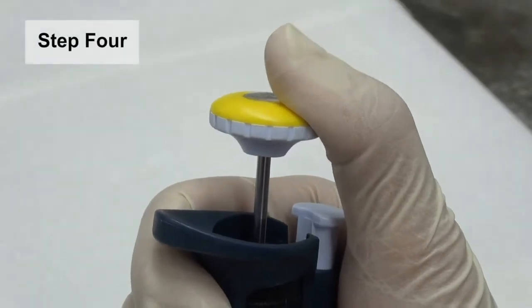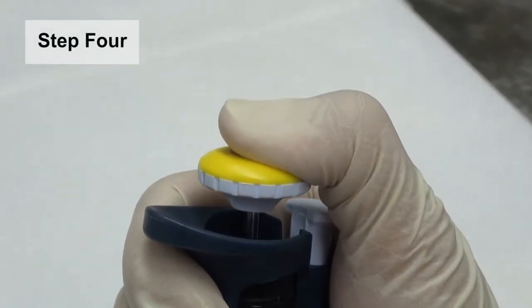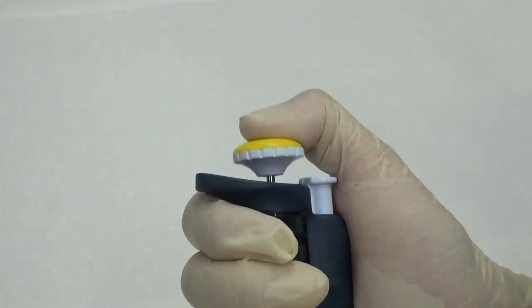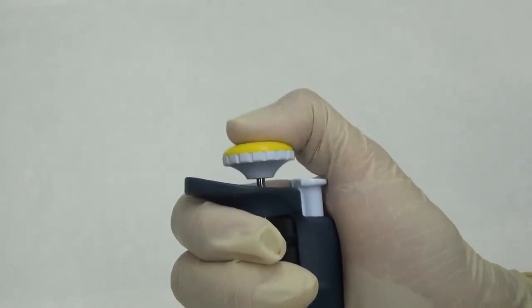Step 4. Gently press down the operating button until feeling a resistance. This is the first stop. Press harder down to reach the second stop. You may practice several times until you feel comfortable with it.